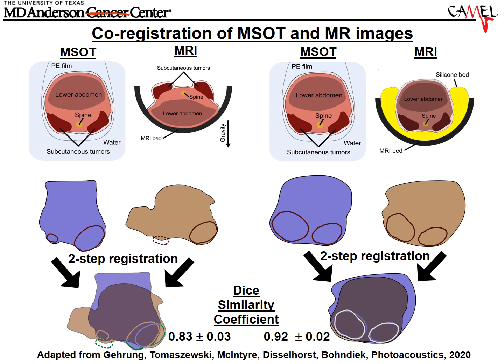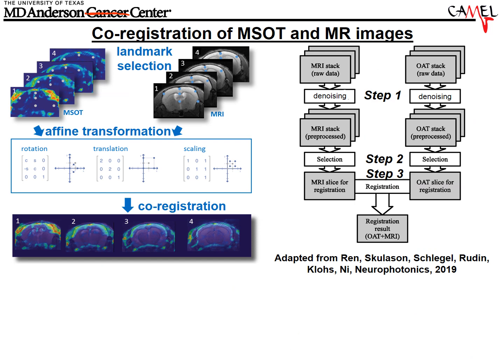So I know this is about how to perform data analysis. That's the topic of our presentation. But again, to emphasize that you really have to think about how you're going to acquire the data in a good way so that you can simplify the analysis or make the analysis work for you. Otherwise, garbage in, garbage out, right? And I think this is somewhat obvious, but it's nice to see an example.